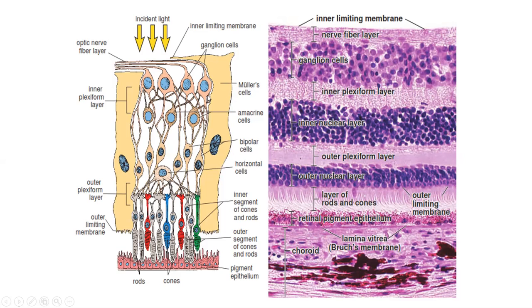So this is this area in the schematic diagram. I can show you that this is a synapse between the dendrites of ganglionic cells and the processes of all these four types of cells. So this is the inner plexiform layer. Next comes the ganglion cell layer.